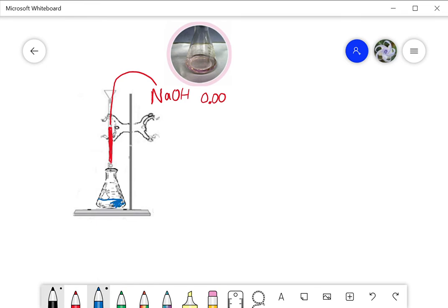Our benzoic acid solution is going to go into the Erlenmeyer flask, and then of course we have to add a little bit of indicator. So phenolphthalein is our indicator—just a few drops, like one to two drops.